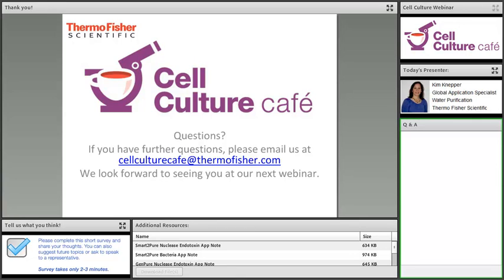Okay, Kim, we have a couple more for you. We have a really good building water supply. The Type 1 system cartridges have not been replaced in a couple of years, and the system still reads 18.2. Should we change our cartridges? So good question.